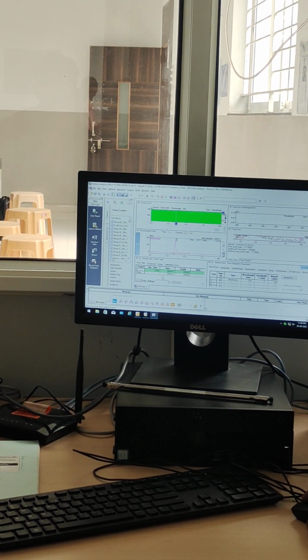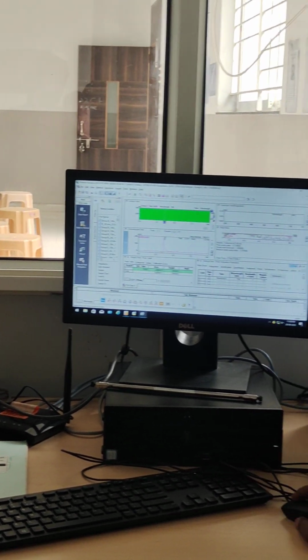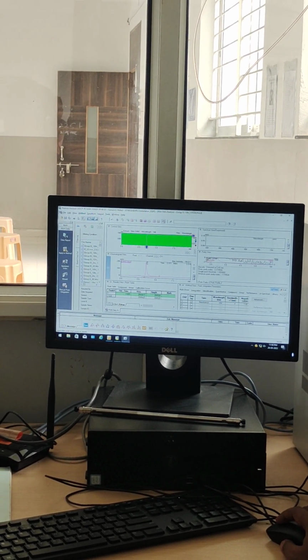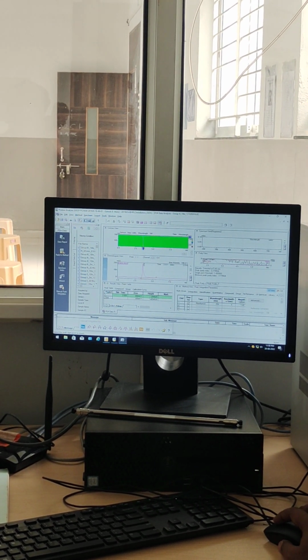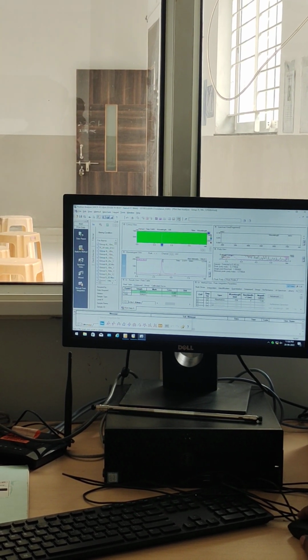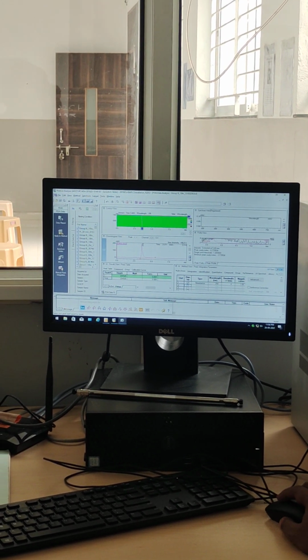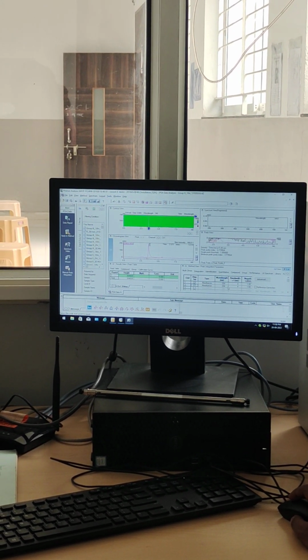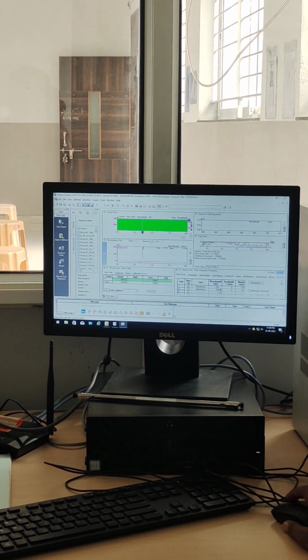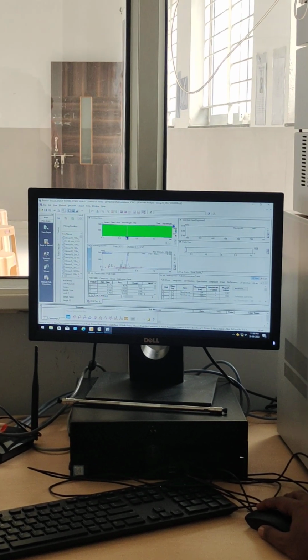And the retention time is 3.6 and the peak area is 2884411. That is the area. Height is also given. Then we will see it. If you want to check another wavelength also, we'll pick here. Edit wavelength. If you want to analyze at the 260 wavelength, then I will make view and I will go for this section. So this graph will come.